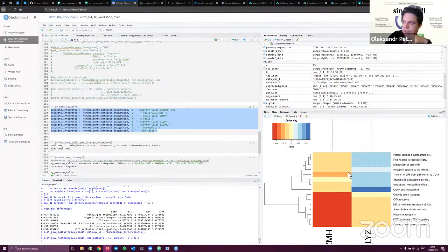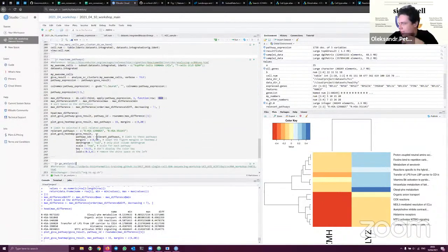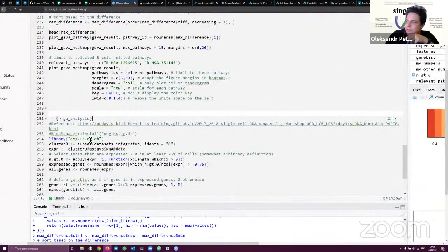And then number 4 and number 5 are actually about the gene ontology analysis, which we don't have time to do today. However, the code is present here. So it's a little bit different way, which we discussed a few days ago, to make some biological meaning from your genes. So it again performs enrichment and interpretation of the gene sets according to the gene ontology database records. So you will see something similar to that in the output. However, it would be a homework to do it independently and ask if something doesn't work.